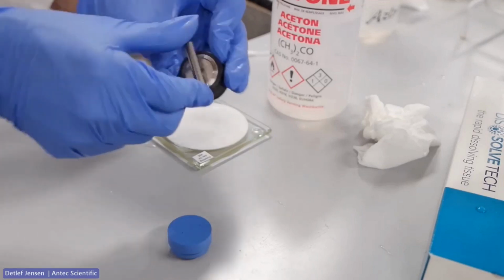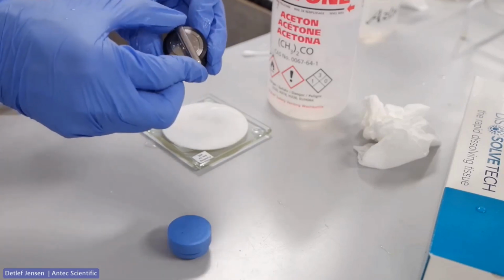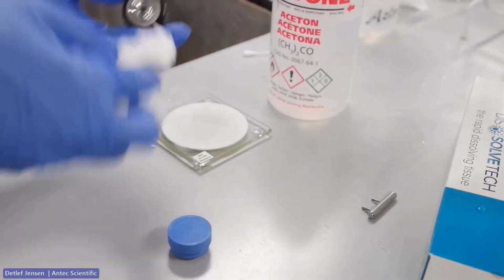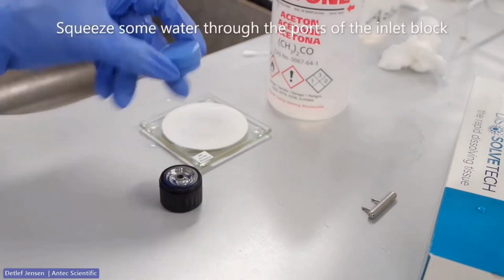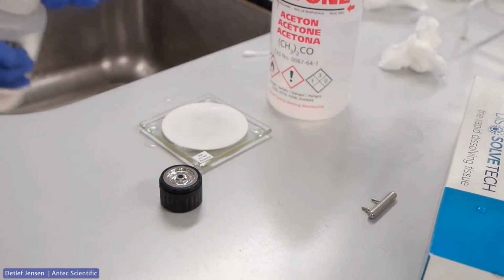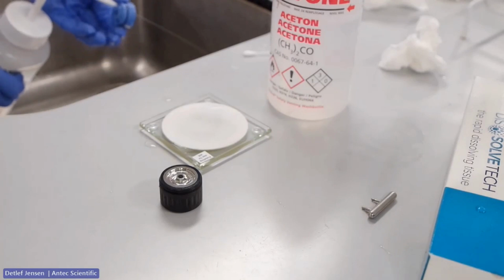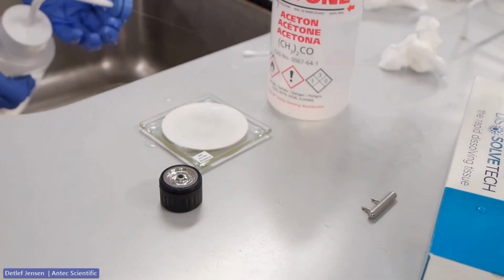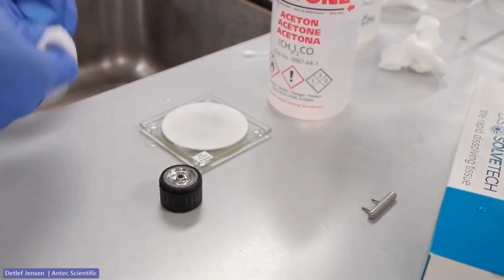Reset the volume to the setting 3, the largest, and then to the setting that you want to use for your measurements. Squeeze some water through the ports of the electrode block, in case that some particles might have ended up there. Dry it.